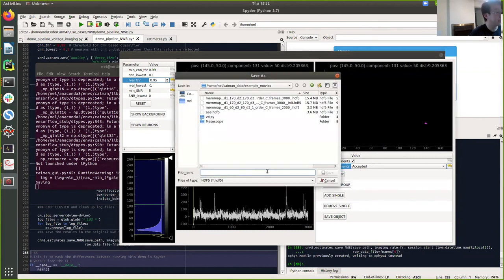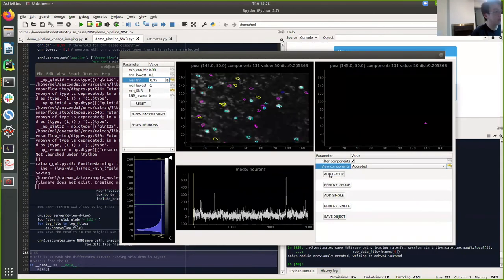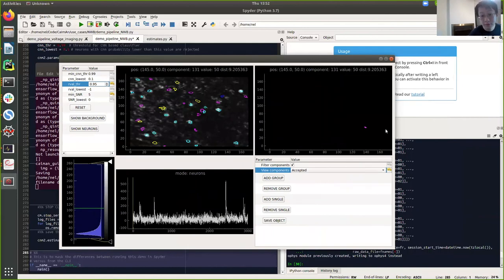And if you think that it contains too many false positive neurons, you can raise the threshold. For example, I don't want the signal to noise ratio to be too low. So I want it to be 10. And you can see that fewer neurons are selected. So you can also play with other parameters. For example, now I want 0.9 R value. And on the left bottom, you can change the spatial footprint of the neuron that's showing. And you can change the contrast of the background.